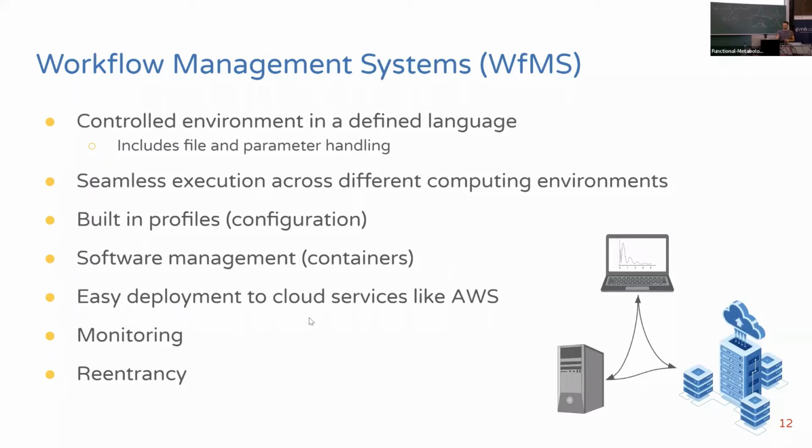The workflows are easily deployable to cloud services like Amazon Web Services, for example. And one great advantage of these services is also that if you have, let's say, private patient data and you want to manage that, you often need certified privacy or data security settings. And often they offer encrypted hard drives and certified solutions.